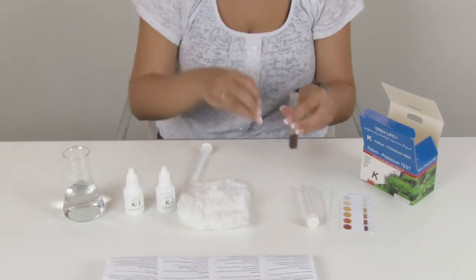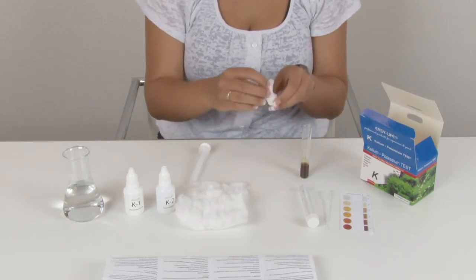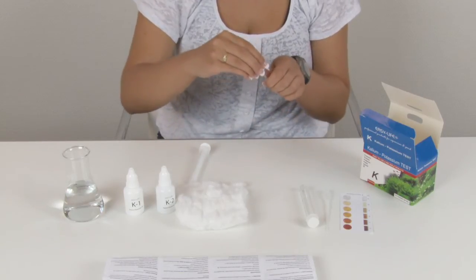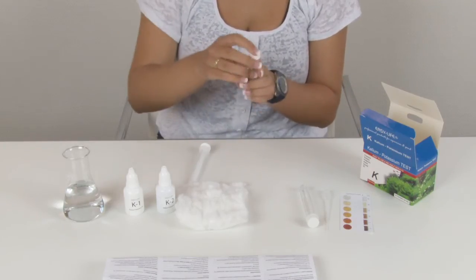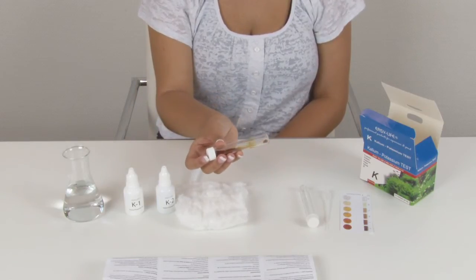Uncap the test tube and press firmly cotton wool into the cap and screw the cap back on. Tilt the test tube and allow the sample liquid to be sucked up by the cotton wool.